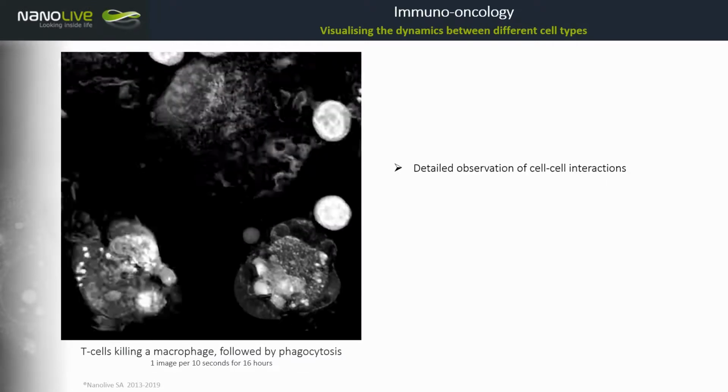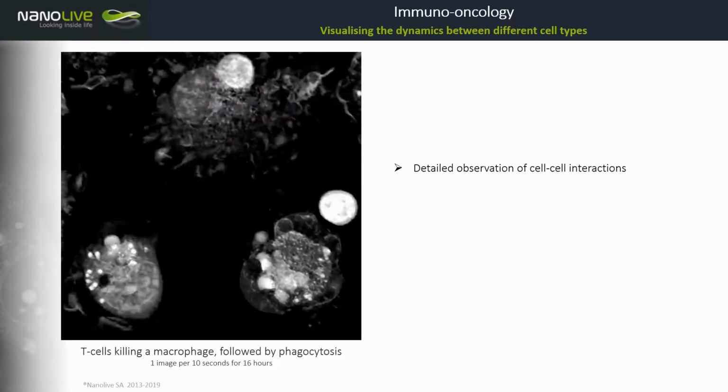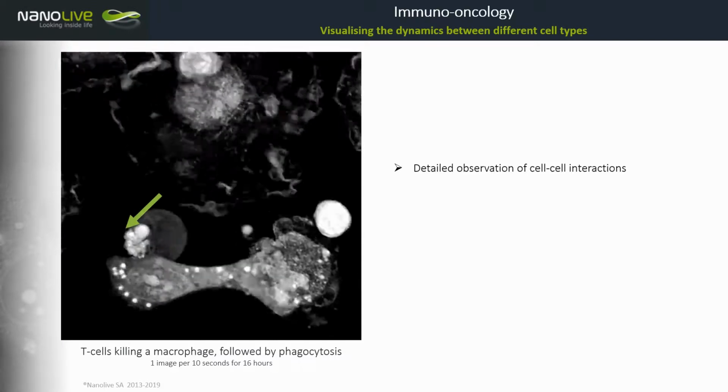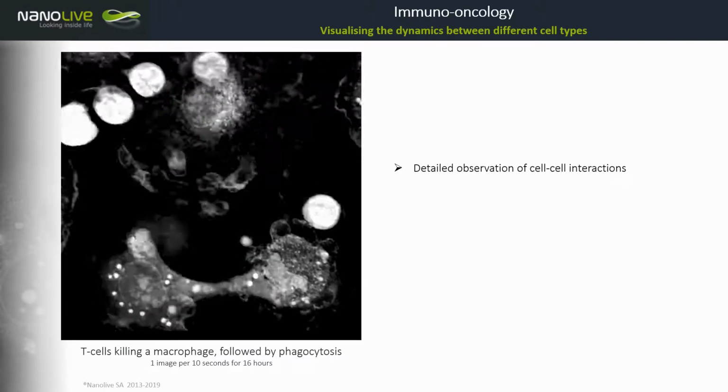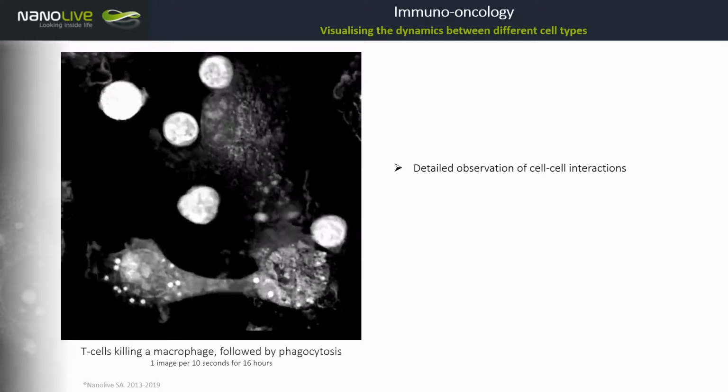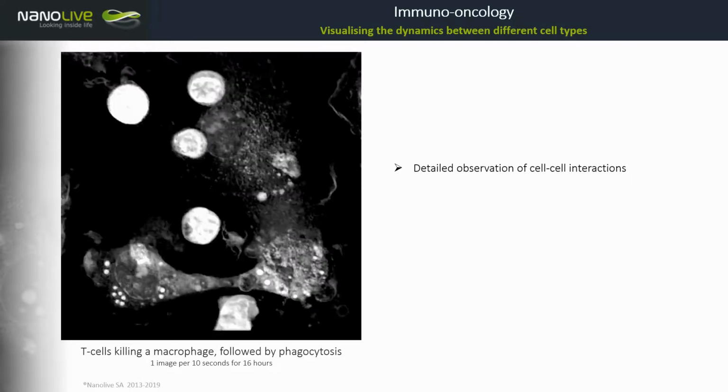After the cell has died, the T cells detach, and this macrophage on the left clears up the cellular debris through phagocytosis. In this moment, you can appreciate the characteristic cell membrane ruffling of the macrophage.